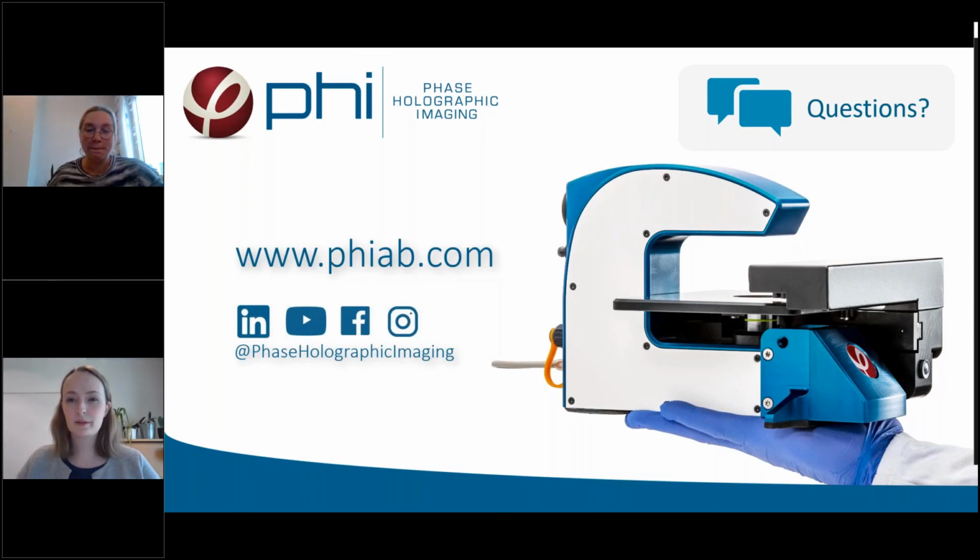Let's talk, there were some questions about the export of data, so we'll pick those two up. Can I export the raw data from the HoloMonitor system? Yes, of course. All the raw data, along with the pre-made graphs, movements, plots, and cell trees can be exported to Microsoft Excel, where you can analyze and present the data in whatever way suits you.